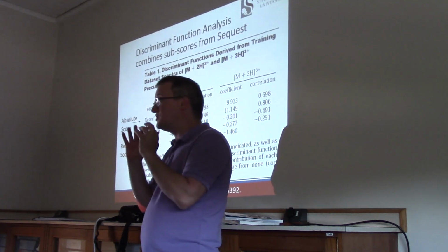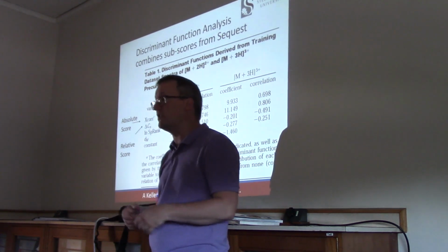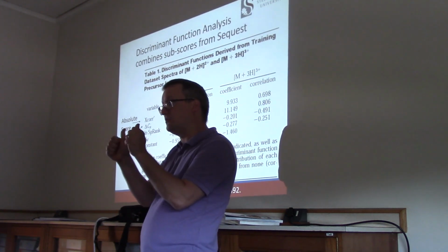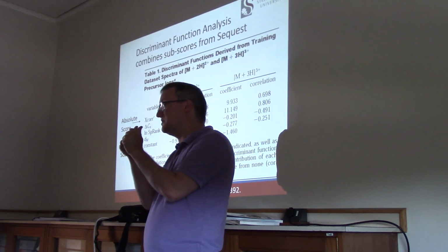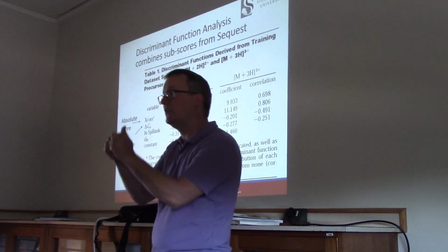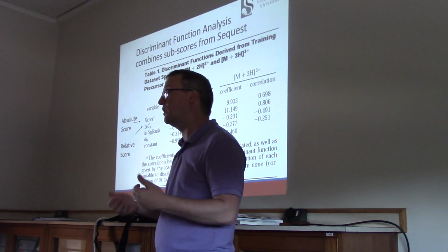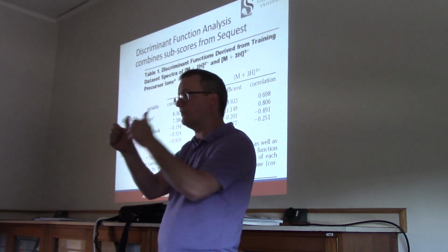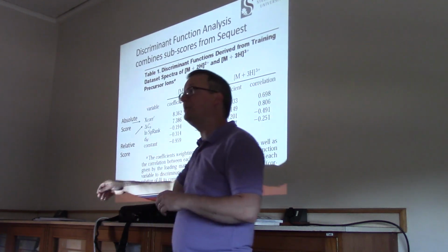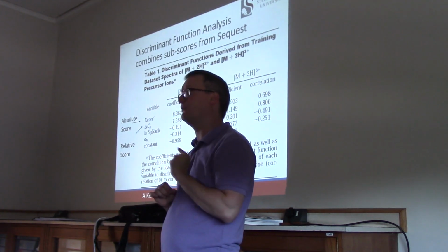So the search engine score, the cross-correlation score or the binomial score that Andromeda uses, doesn't really take into account whether the peptide ion was measured to be close to this sequence's mass or far away. So Nesvitsky realized that he could compute the delta mass and use that as another score. If they're very close, give it a bonus. If they're very far apart, give it a detriment. All of these things could be combined together to give more information than any one score by itself could achieve.